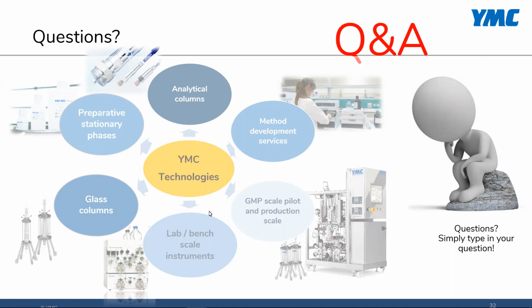Formerly, there was a company called Lewa Process Technologies, and that company and its assets were purchased by YMC Corporation at the end of 2018, 2019. So it is essentially a continuation of the platforms that were developed under Lewa Process Technologies that has been assumed by YMC, and YMC also purchased a partner to that company called Chromacon AG. Chromacon was R&D and patents holder for many of the continuous chromatography systems that are now part of the YMC portfolio.